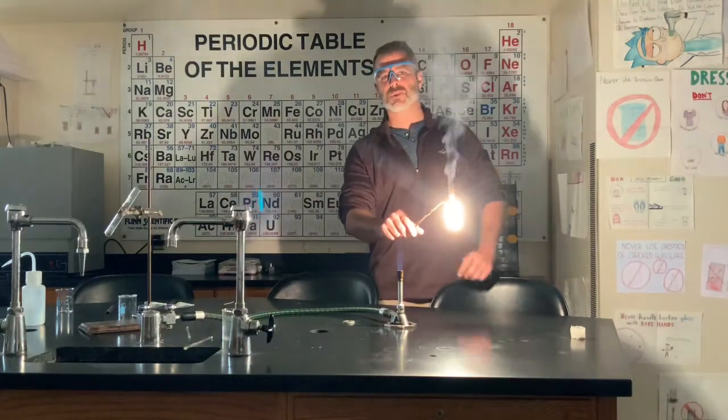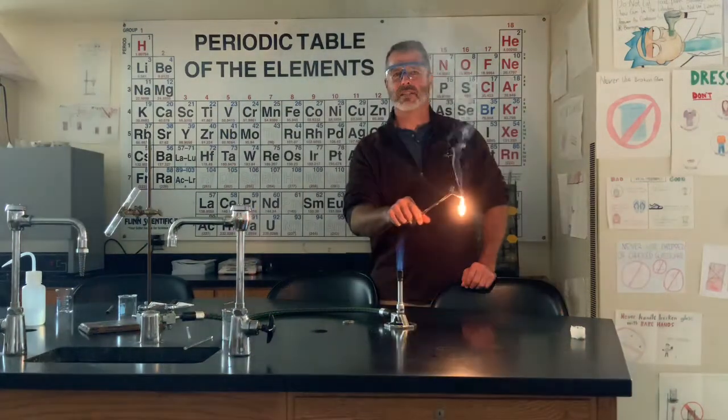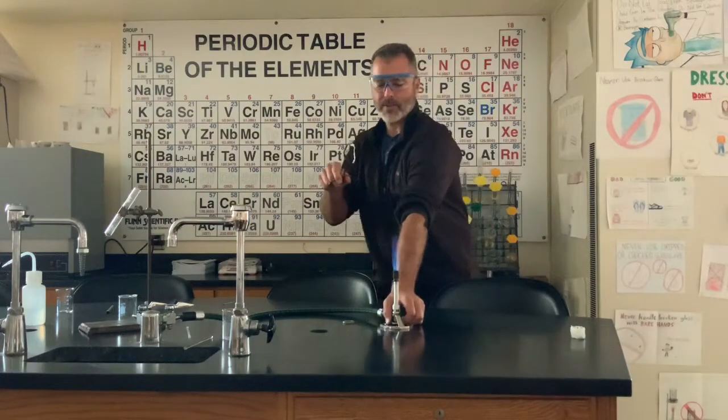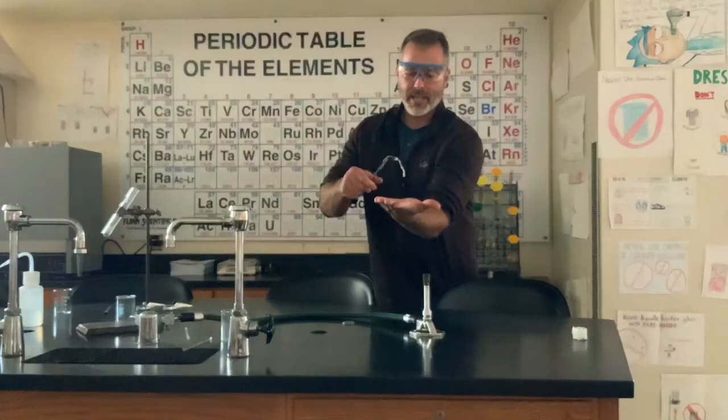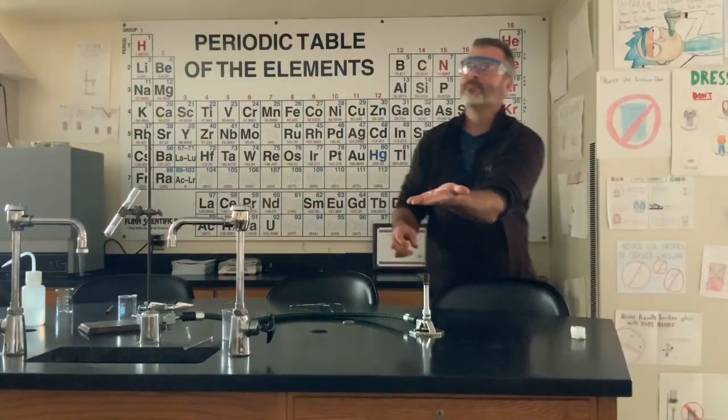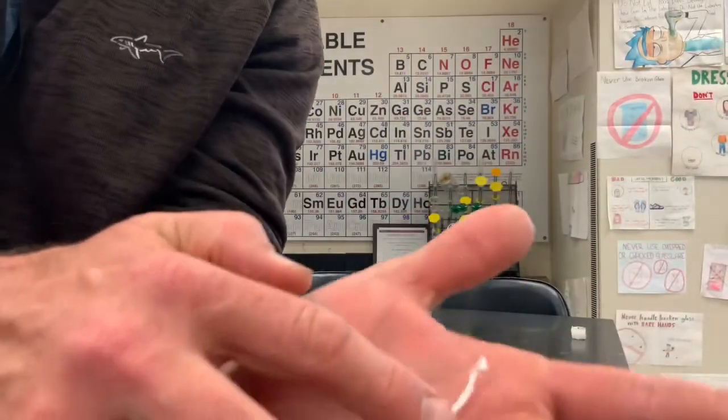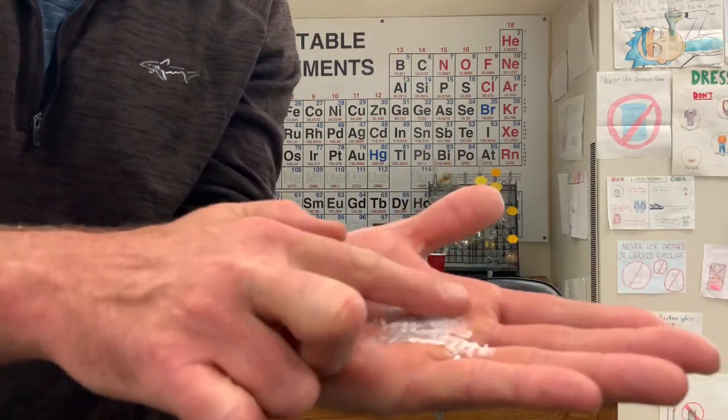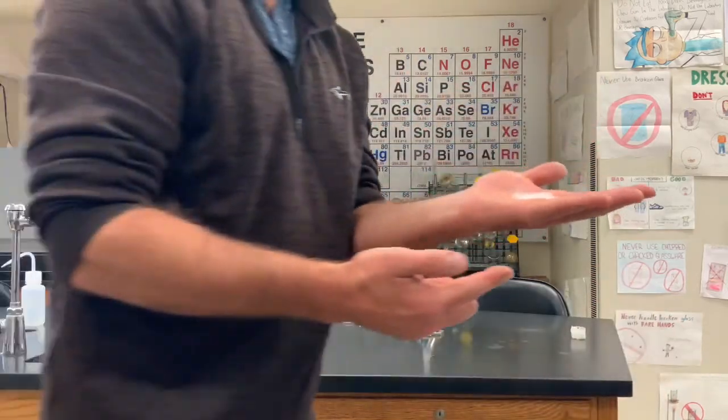But you can see it is reacting with the oxygen in the air to make a nice, bright, white-looking flame. Now let me turn this off real quick. And this is actually now a powder. So if we look at this, it went from metal to this really delicate white powder. Very cool synthesis reaction.